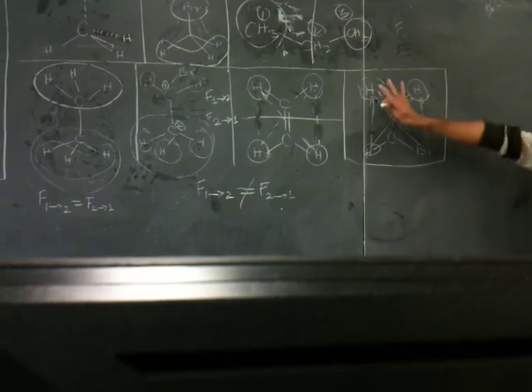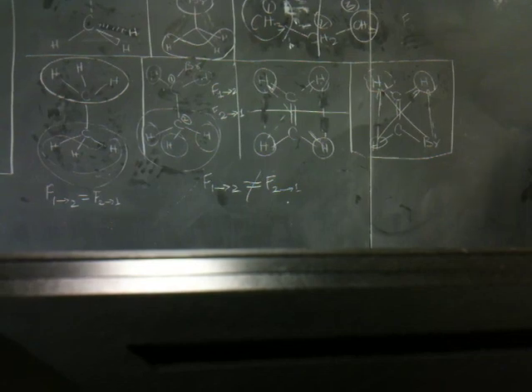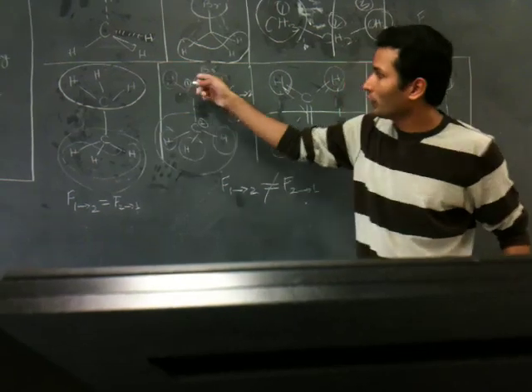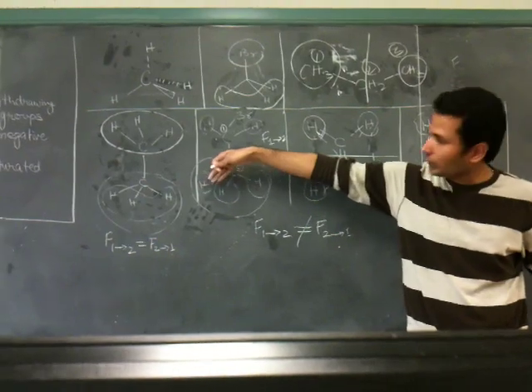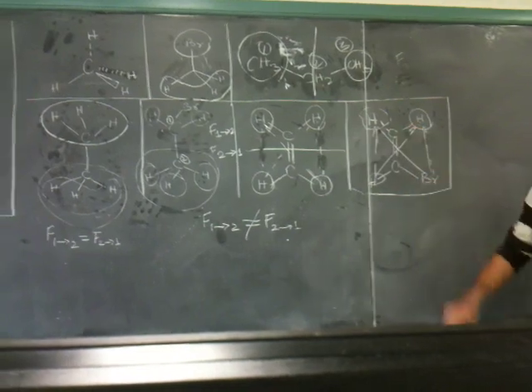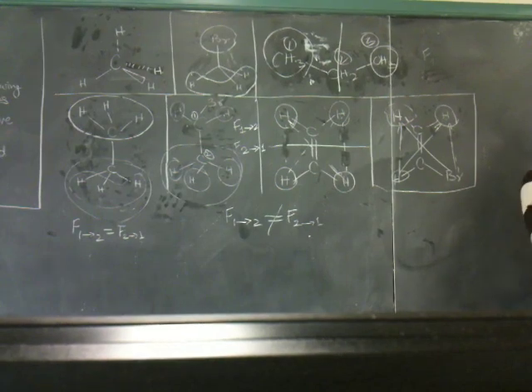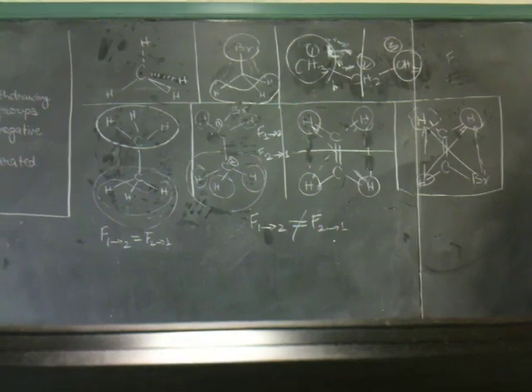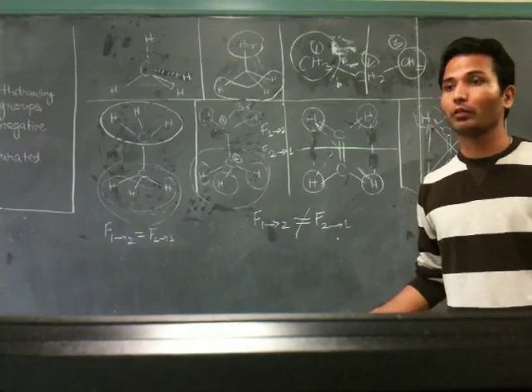So now you can see what I mean by chemical environment. You have to literally see whether the molecule is free to rotate or not. If it is free to rotate like this one, the forces due to this one will be averaged out on each of these, so these will give you 1 peak. But if the molecule is not free to rotate, the peaks will be different or a little different. If it is not drastically different, it will be a little different. Clear? So that is all about your chemical environment. Now we can move a little faster.